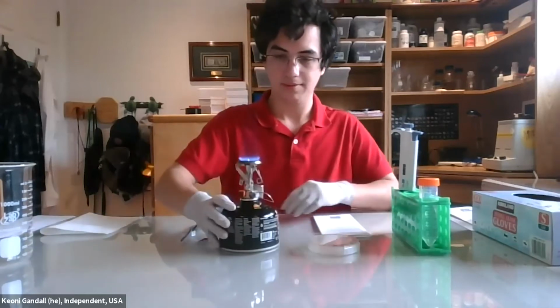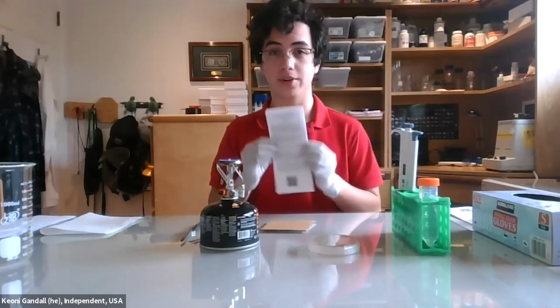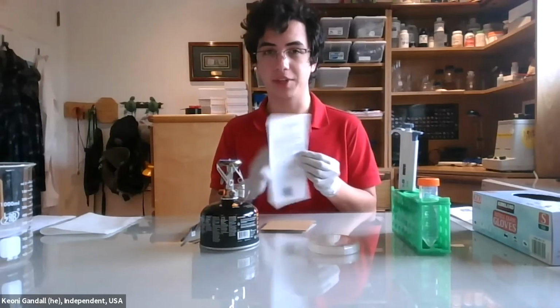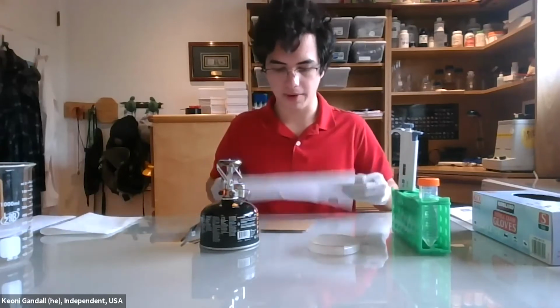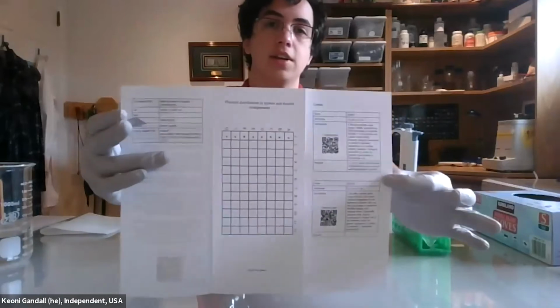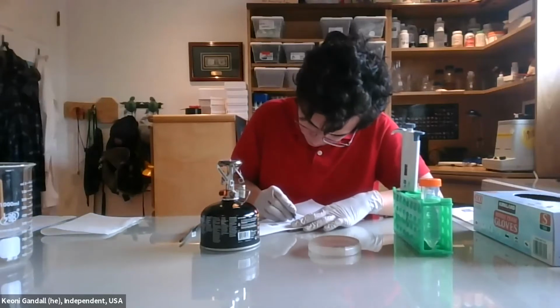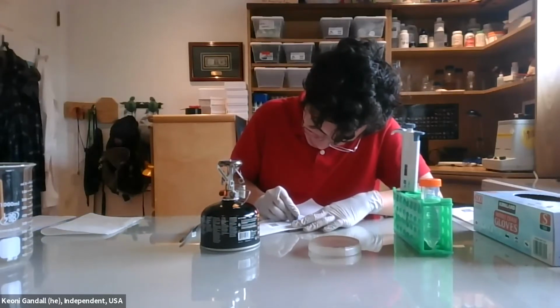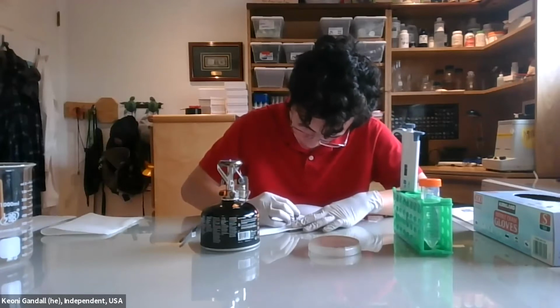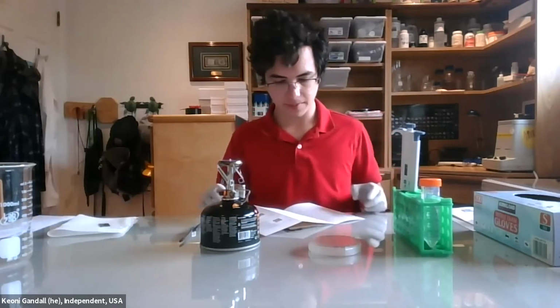Sterile technique is important. All you have to do in order to get a strain out from this piece of paper is lay it open, place it onto cardboard or some other cutting surface, and make a small incision to cut out the dot, which here is the dot, so you can see it again. And I'm going to cut one out. I just make four cuts around the dot, kind of like hole punching it out, except with a razor blade, because it's easy.